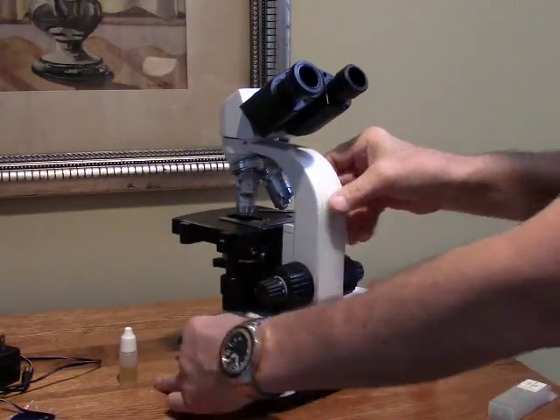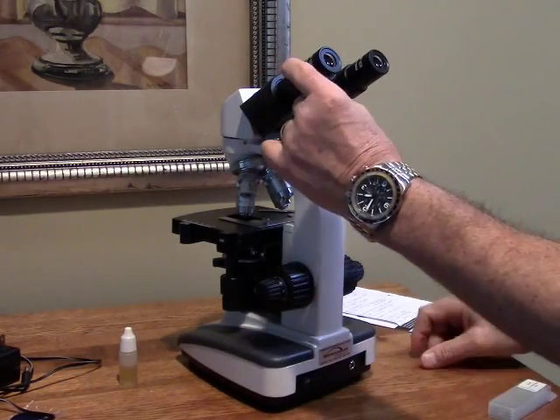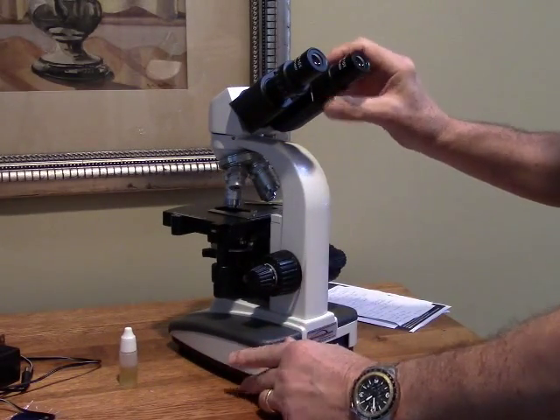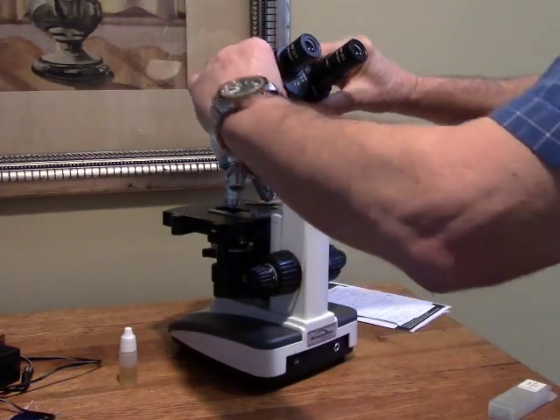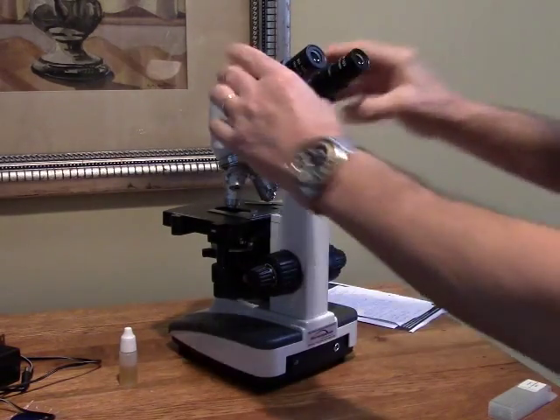The eyepieces are 10x as mentioned and there is a diopter adjustment on the left eyepiece. When you use this microscope you focus first to your right eye and then fine-tune the left eye using the diopter. You also have a pupillary distance adjustment to get the eyepieces adjusted to your head just right.